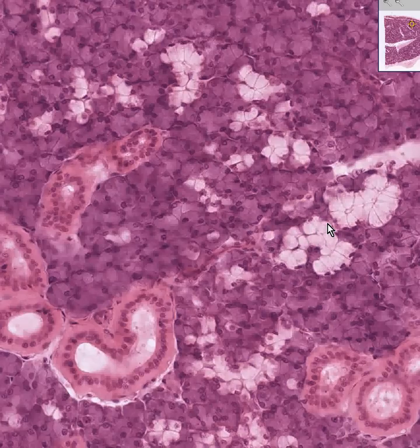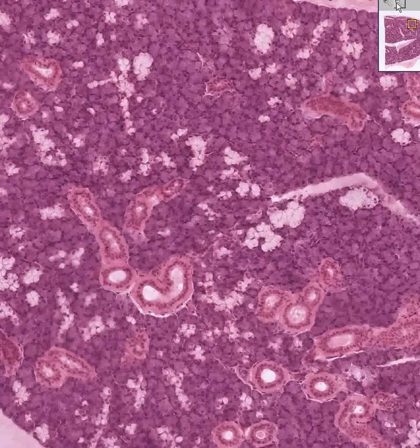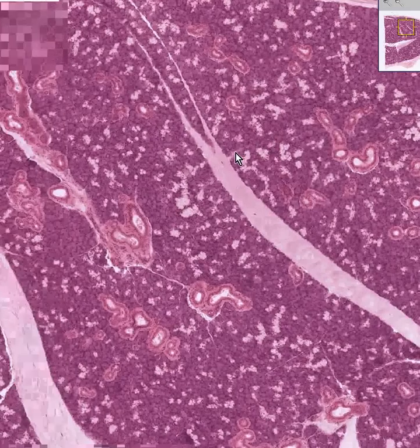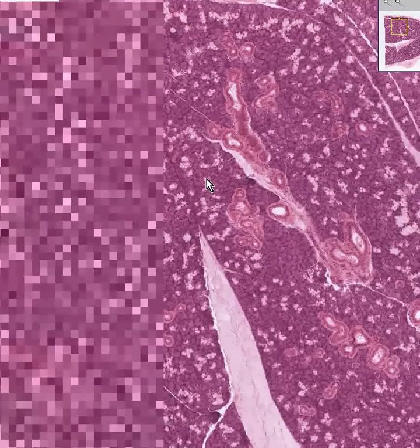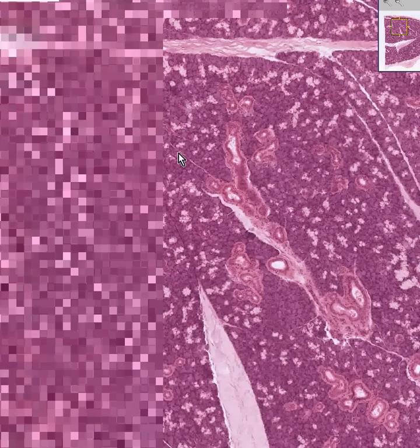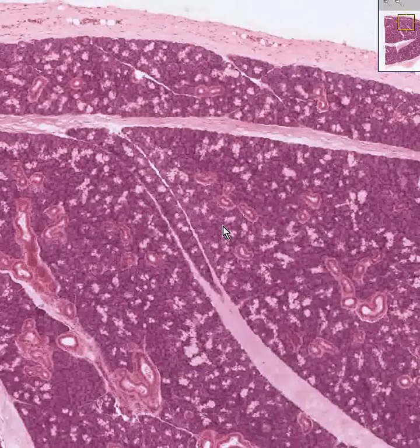I would really like to find a nice intercalated duct if I could, because most of these intralobular ducts here are striated ducts. Could this possibly be one? No. I don't think we're going to see any. Maybe we'll see some on our next salivary gland, because I don't want to waste too much of your time.